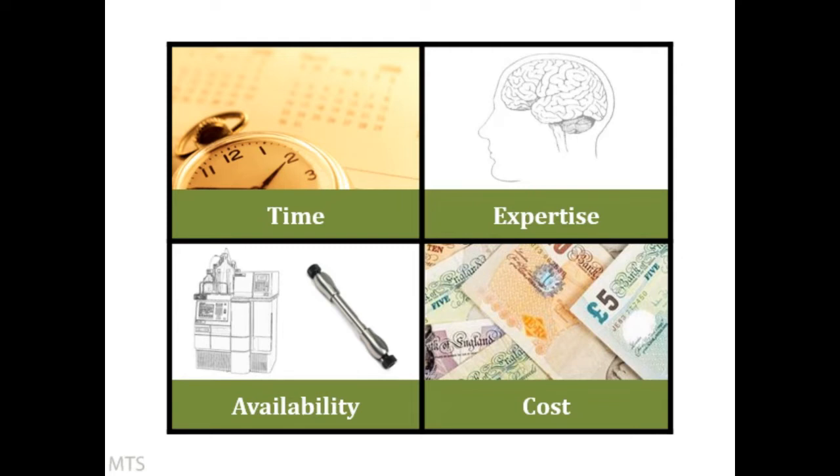In terms of reagents, what have I got access to? So have I got any solvent I want, or am I limited in terms of what's in my lab? And instruments. So we're assuming you have access to a HPLC, but do you have a UHPLC? What detectors are on the end of that system? That will have quite a big effect. So those are some of the things around availability. So it's quite a broad general area, but you will be constricted by whatever is an option for you.